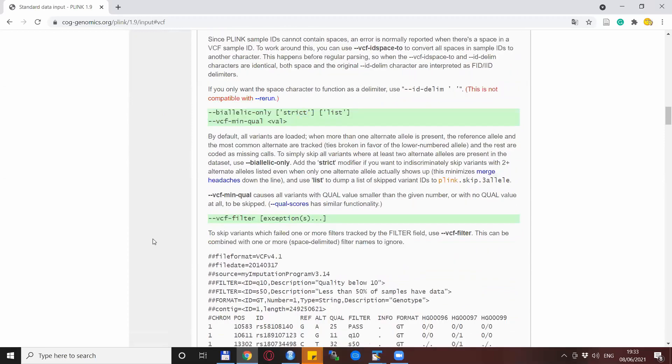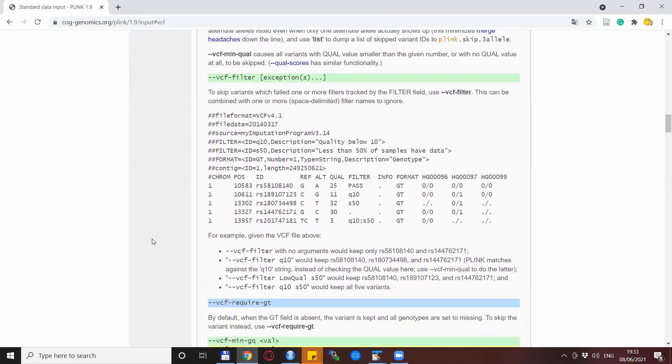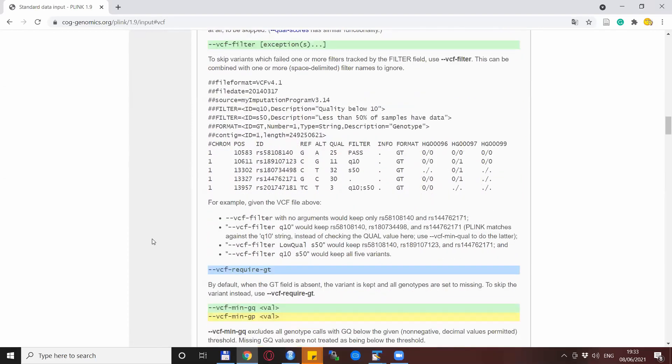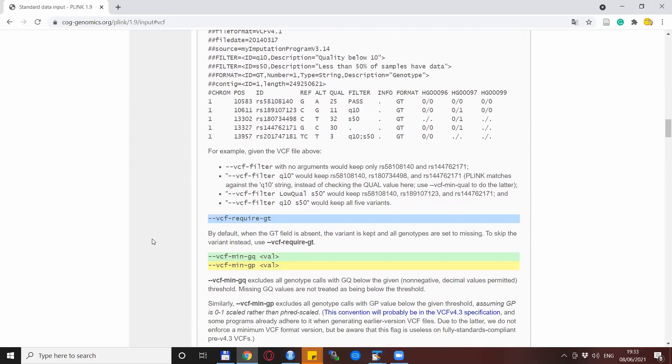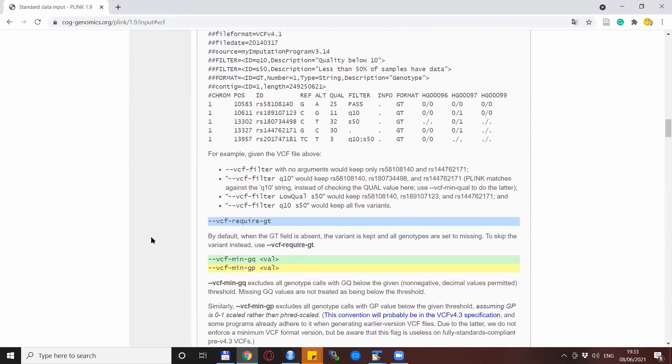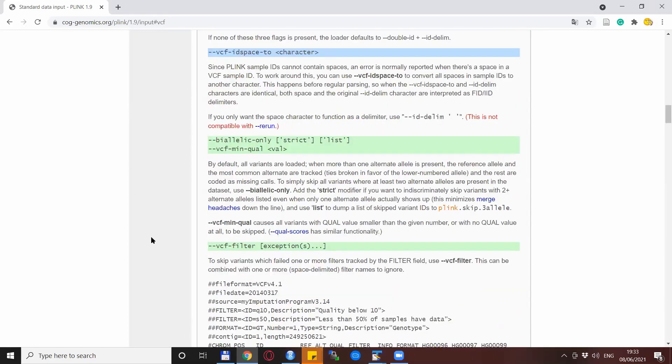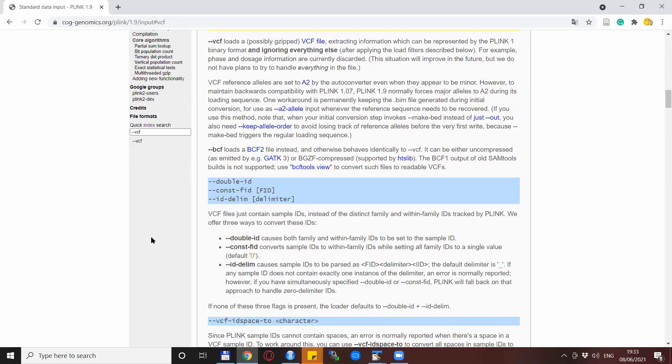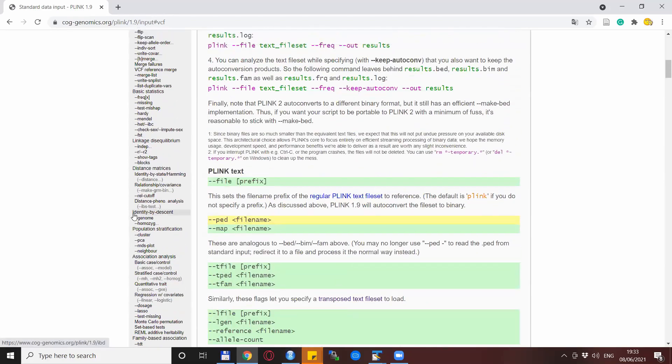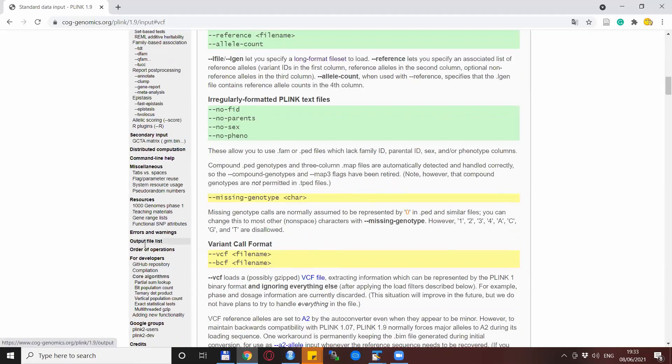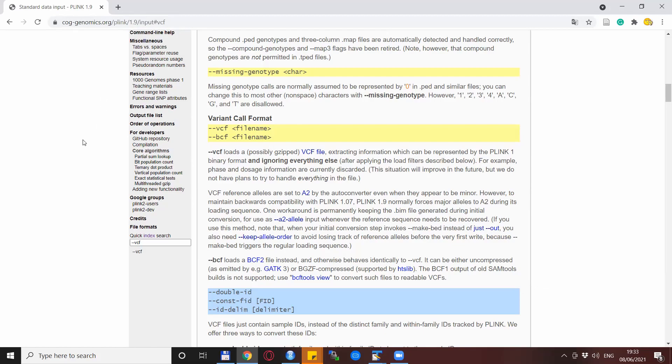In general, there is quite a bit of description for various other VCF-related options in Plink. So if you are dealing with VCF files, I really recommend you to read this part of the Plink website. You get here by searching dash-dash VCF in the quick index in the left side of the navigation panel, or if you specify this address in the browser.